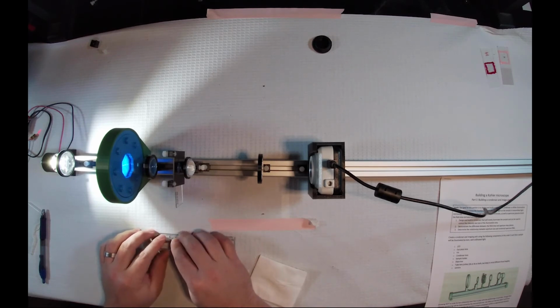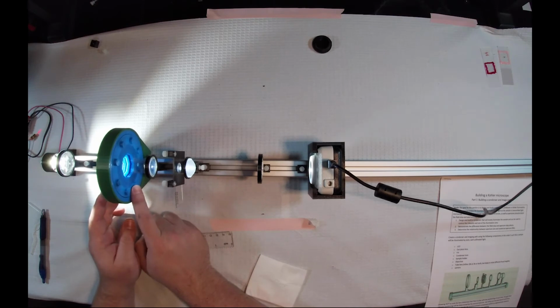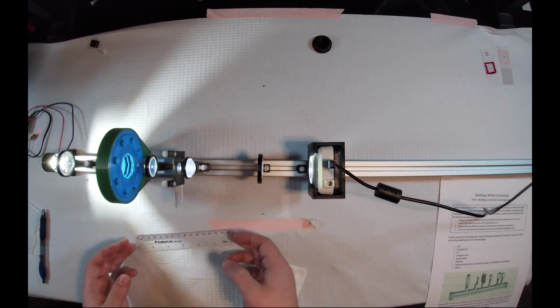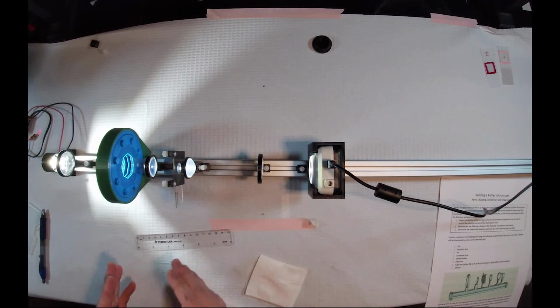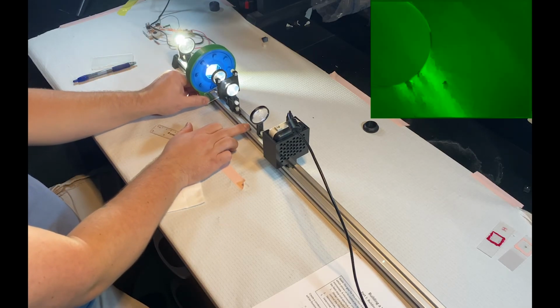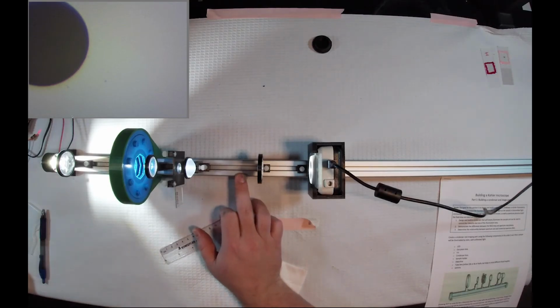And once you've done that, we will now calculate what is the numerical aperture of our system when the aperture stop is fully open. Now, what is limiting the amount of light in this case? Is it the aperture? Well, I can move this a little bit closer to my condenser, and I give that a look.